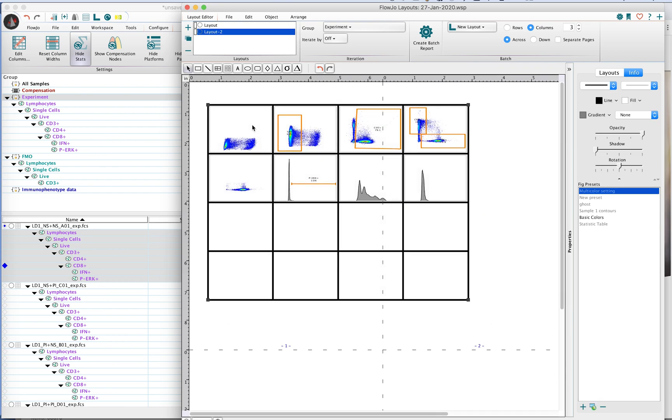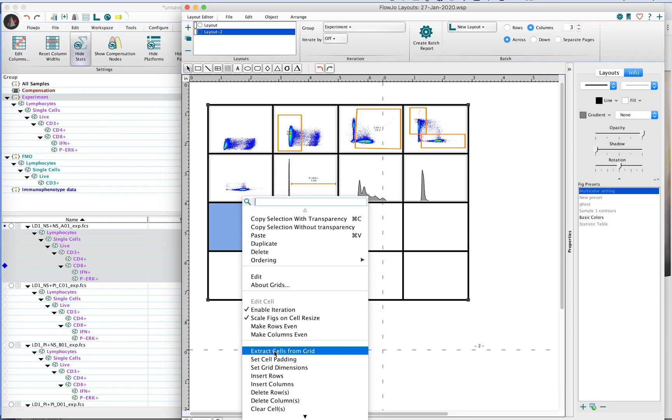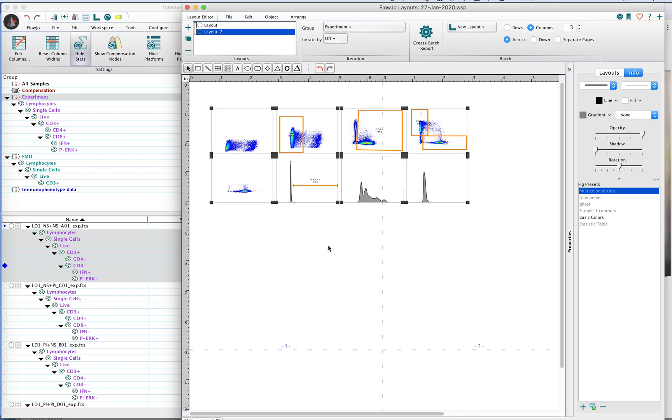You can move the grid around and you can actually get rid of the grid if you don't like it as well. You highlight the grid, right-click on it, and you can say 'extract cells from grid' and that will remove your plots from it.